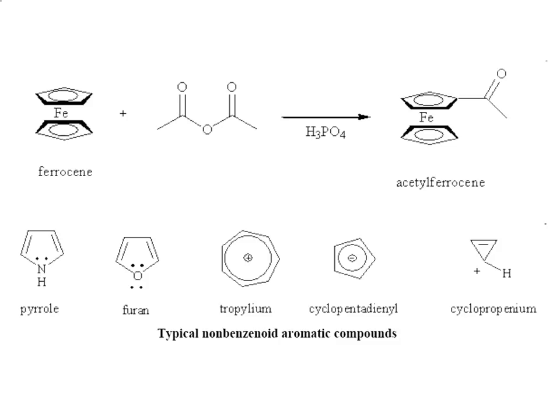So ferrocene actually undergoes a Friedel-Crafts acylation. You can use the typical Friedel-Crafts conditions, but it turns out ferrocene will also react under the conditions shown with acetic anhydride and different acid catalysts, and this is because ferrocene is actually more reactive than benzene in Friedel-Crafts acylation. The reason people give is that the cyclopentadienyl that gets substituted is negatively charged, so it's more nucleophilic.